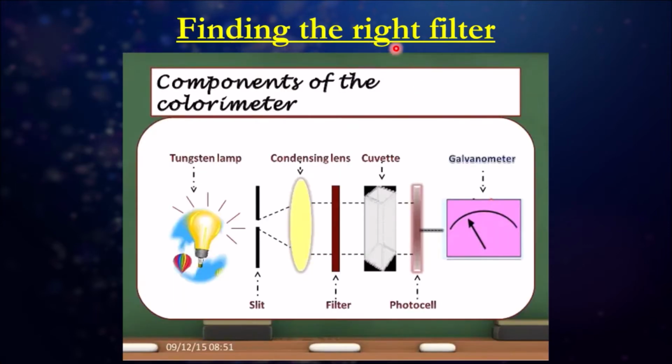So we already talked about the setup. Let's talk about this component here, the filter. How do we know we have the correct filter for the investigation we want to do?